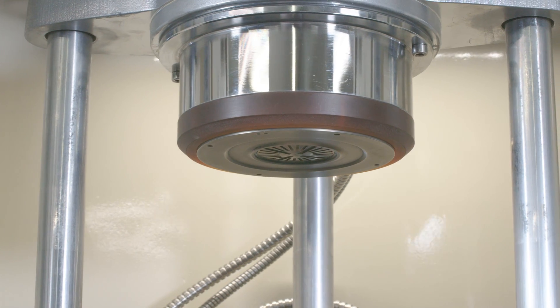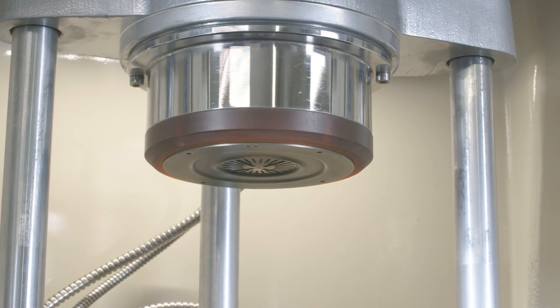The torque sensor assembly is tested to ensure linearity, repeatability and hysteresis.